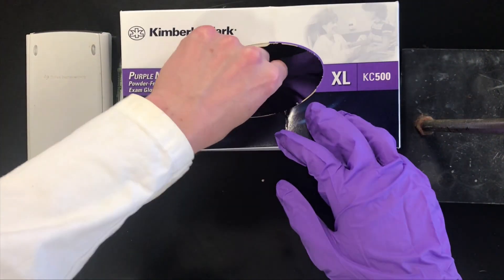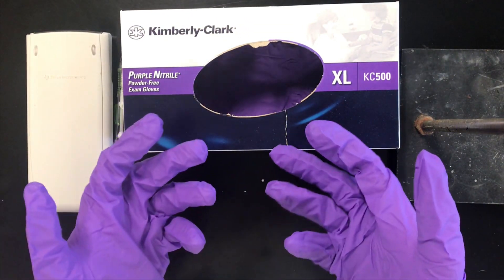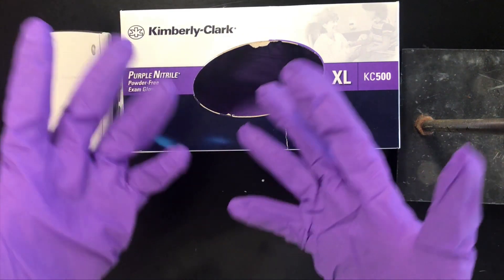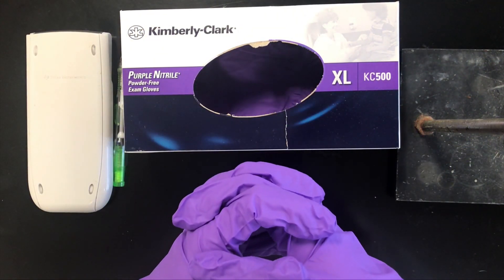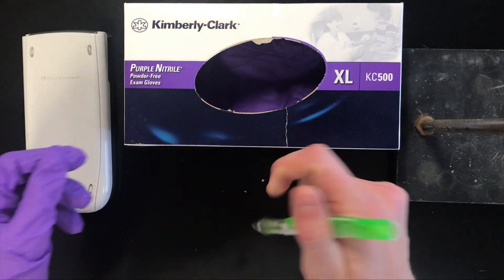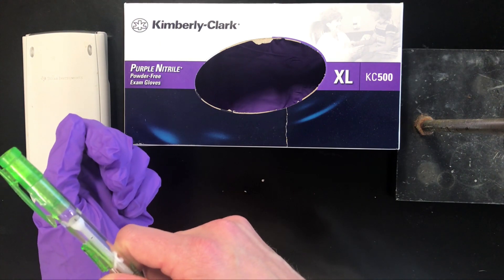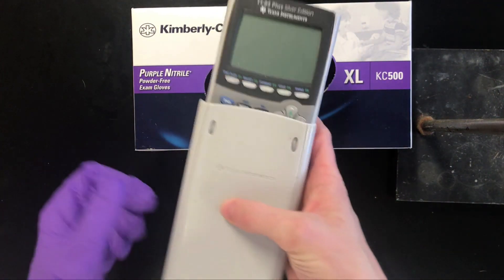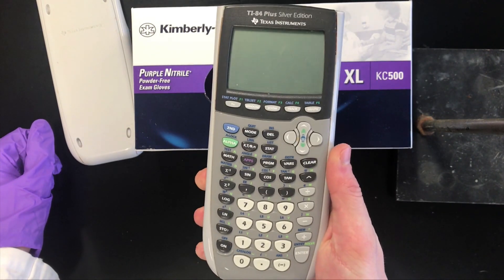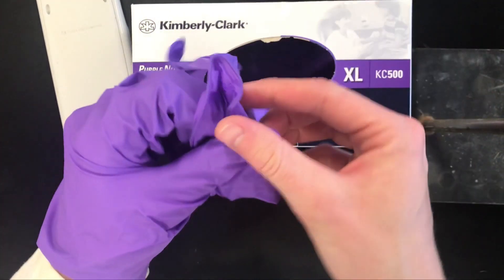In terms of changing gloves often, a common reason you'll need to do this is when you're recording data or doing calculations, which involve things you'll take out of the lab — pencils, pens, your lab notebook. You don't want those exposed to reagents. So if you're going to handle a pencil and you're right-handed like me, just take off your right-hand glove and use that ungloved hand to record data. You can even do manipulations with your gloved hand at the same time. This ensures your pencil doesn't leave the lab with chemicals on it. Same for calculators or a cell phone — just make sure you're using it with an ungloved hand. Remember this one-gloved, one-ungloved hand trick whenever you need to use something that's going out of the lab.